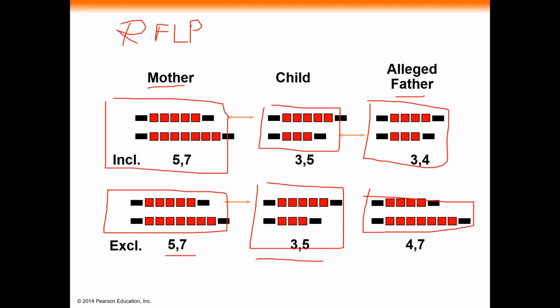This is a terrible picture to talk about this, isn't it? But anyway, the results of the story are the same: if the father was the father of this child, we should see the child have some polymorphism that was similar to the father's. When you don't have that polymorphism that's similar to the father, then that person is not the daddy. And that's what they do on that Maury Povich show when he says, "You are not the father."